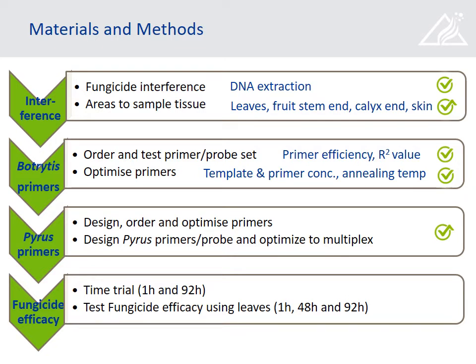This is based on what we saw from an article. This primer probe set has been ordered. It's currently in our possession. We still need to optimize it though. And after we've done that, we would like to optimize it with a multiplex to see if this is possible, just to simplify our PCR process as we go on with this.